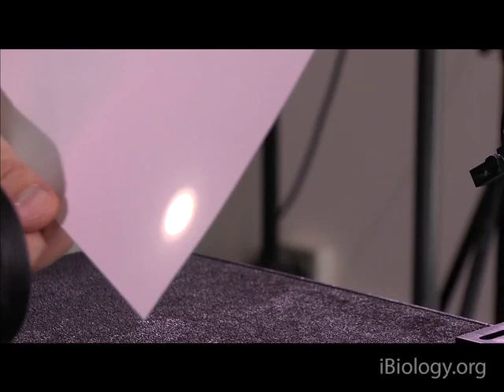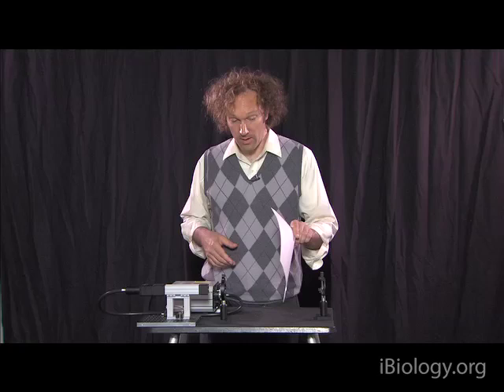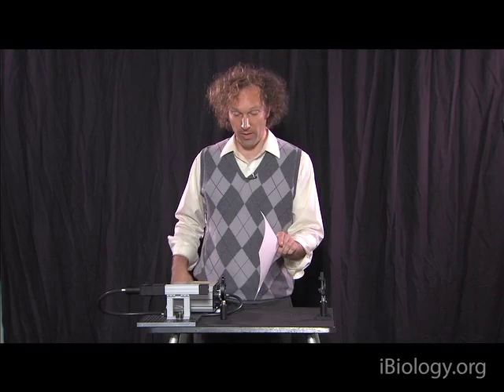Now we see it expanding again, tight, and expanding again. This is often a simple way of figuring out what lens you have. If you have a lens in a drawer and you want to know its focal length, you can take a light source, even an overhead light, and position it such that the overhead light is in focus, finding the minimum spot. Then take a ruler and measure that, and you can get an estimate of the focal length of the lens.